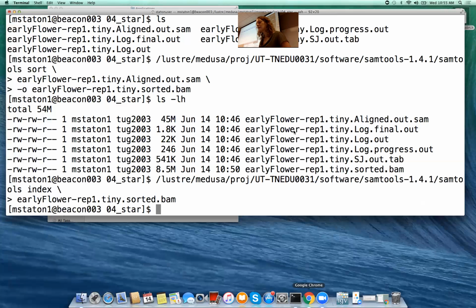So here it's giving us, for each chromosome, where the genes are, but we can zoom in. If you want to zoom in, you click and drag at this top bar. So I'm going to keep zooming in. We're starting to see our genes. So we're on Prunus persica chromosome 1 from 14.3 million bases to 14.4 million bases, and we can see that these are the locations of our annotated genes.